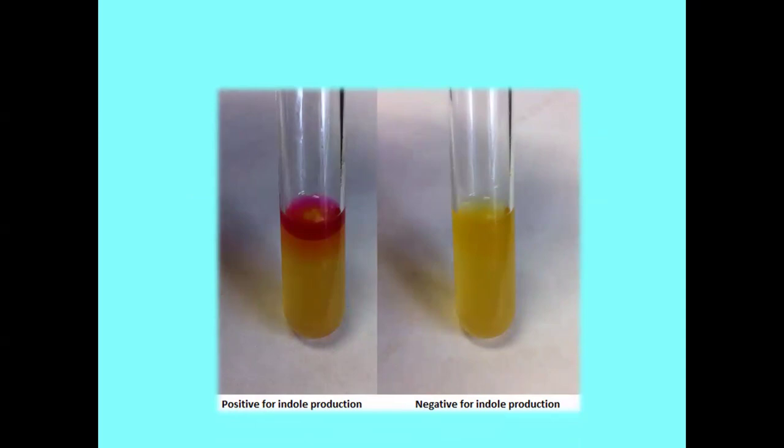By the time when you add Kovac's reagent, the amyl alcohol and hydrochloric acid help in the extraction of the indole from the whole medium. In most of the tests, when you add an ingredient or the reagent, the whole media will change color. But in this indole production test, the indole is extracted by amyl alcohol and hydrochloric acid and brought to the solvent layer, and that is the reason it produces a cherry red color only on the top portion, the inner layer. And when it is not producing any color, that indicates that indole is not produced.